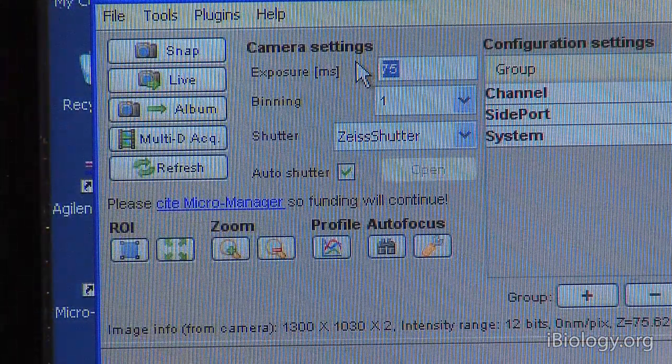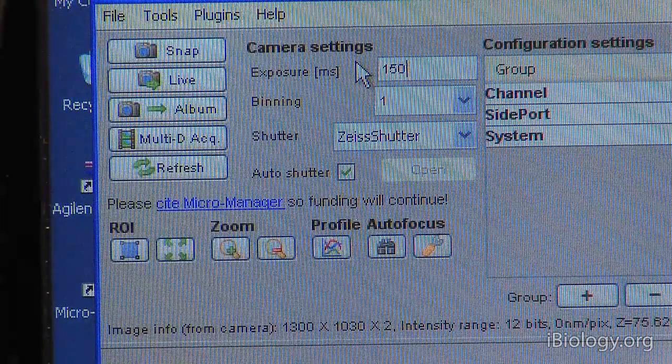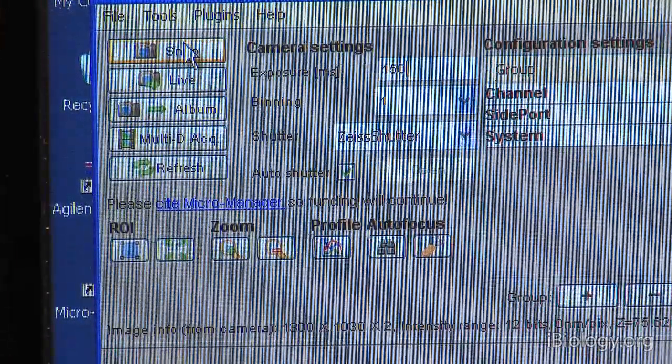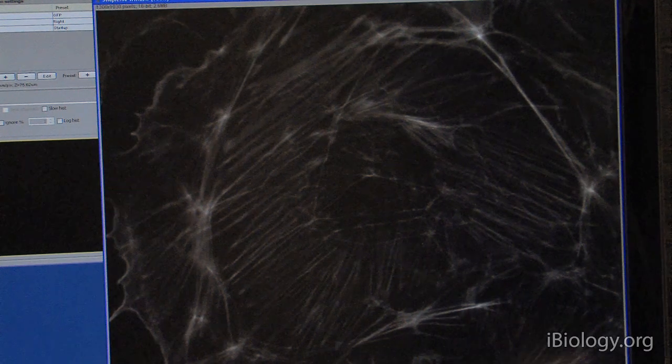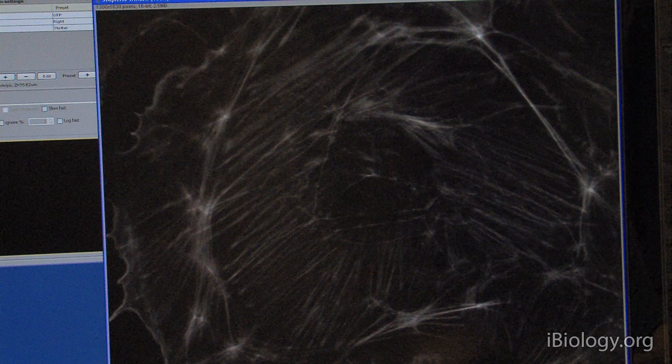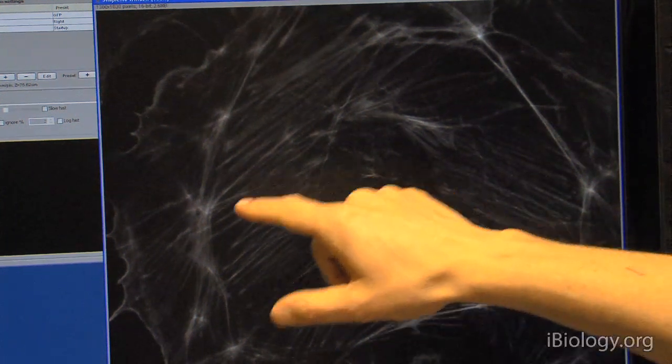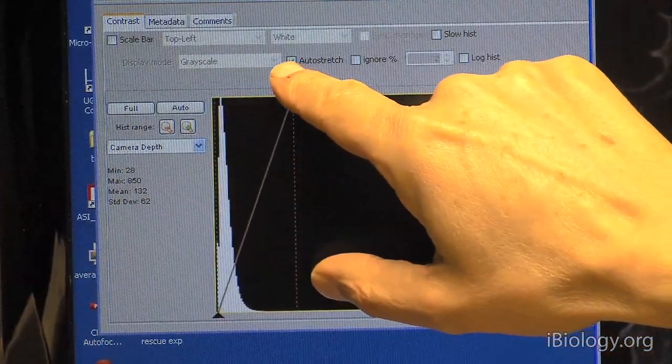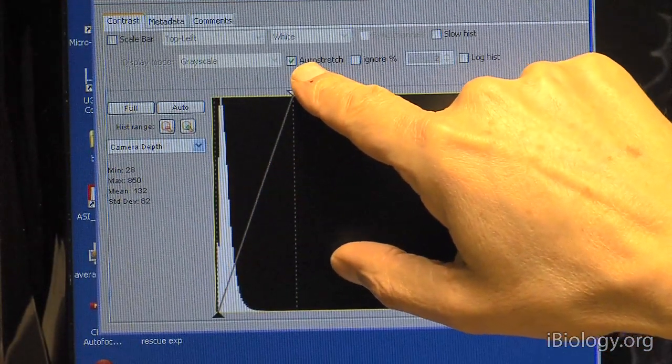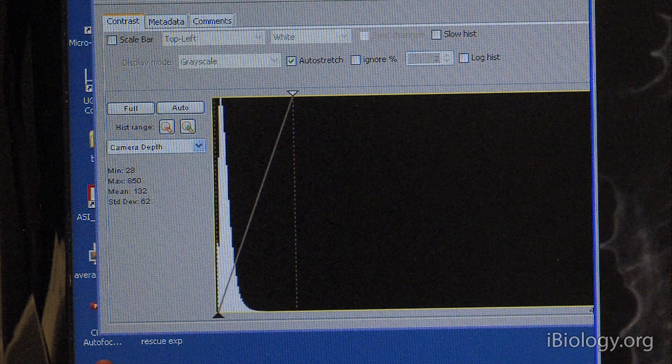So I can set an exposure time that is twice as long and then snap an image. And what you notice is that this image actually looks very, very similar. It didn't get twice as bright. And that is because here in this part, we have set the auto stretch checkbox.